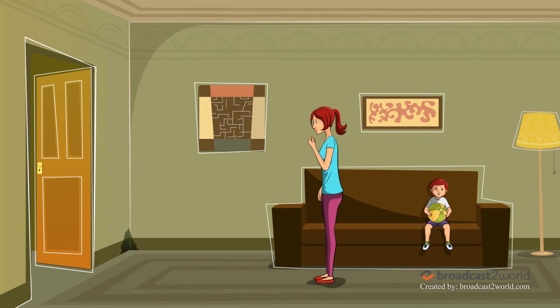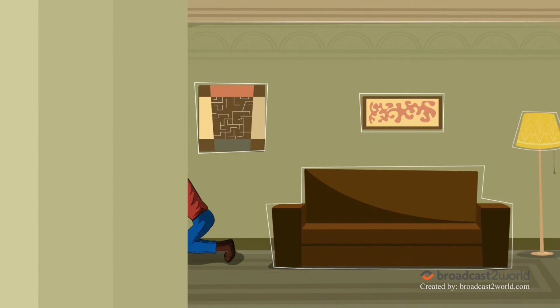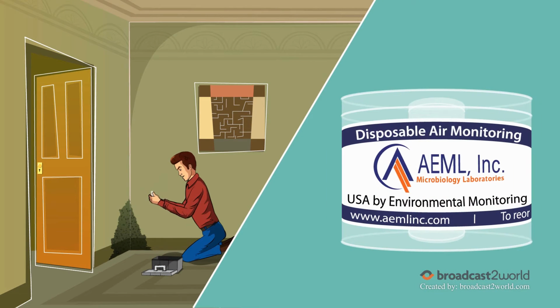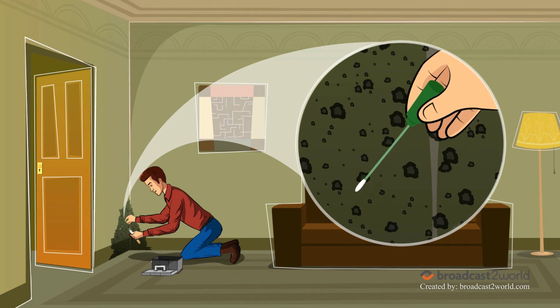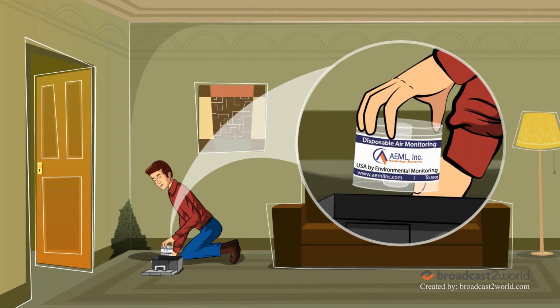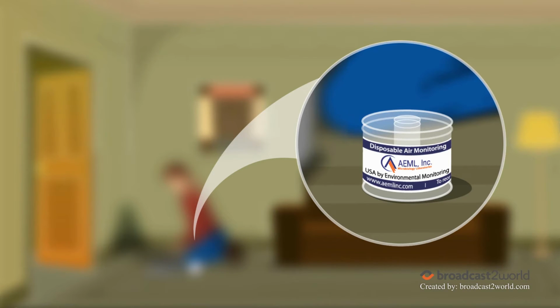If you suspect a mold problem in your home or office, a professional mold inspector should be called to inspect the property. The professional will visually inspect your property and may take surface or air samples. If mold is visibly present on any surface, a sample of it may be taken using transparent tape or a specially designed swab. To see if there are elevated levels of mold in the air, samples are taken using a specially designed cassette called a spore trap.